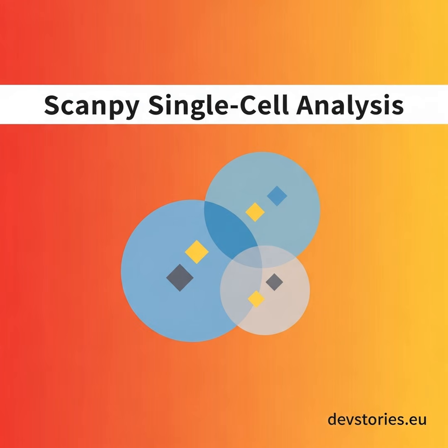Scanpy Single Cell Analysis, Episode 8 of 16. The secret to modern single-cell analysis is not just plotting points on a grid. It is understanding exactly which cells are neighbors in a massive high-dimensional space. If you get that underlying structure wrong, every visualization that follows will mislead you. The mechanism for capturing this structure is the nearest neighbor graph, and today we are looking at how to build it and project it using UMAP.